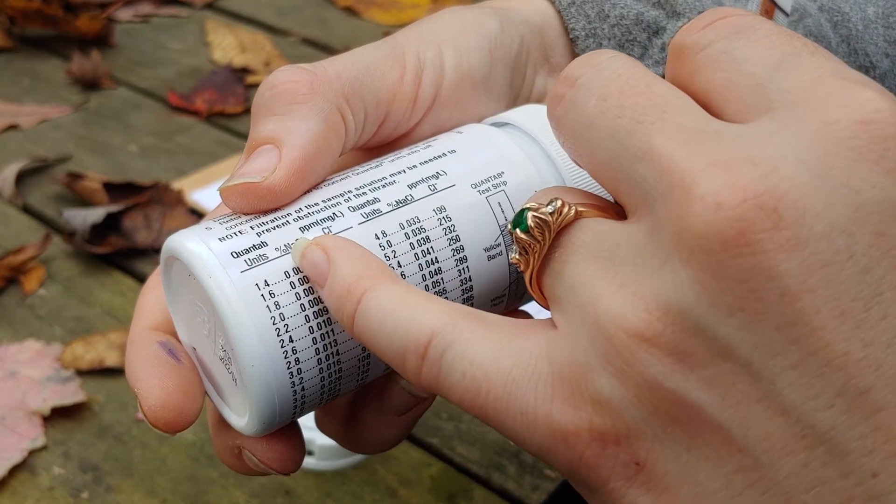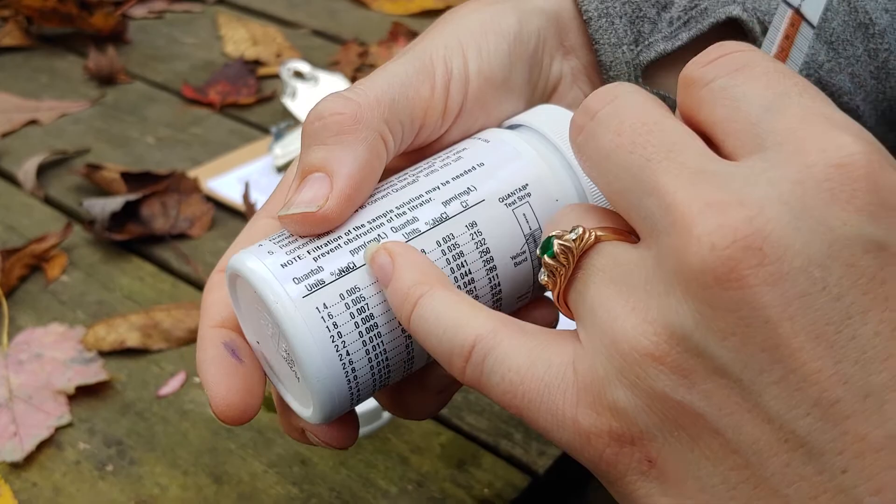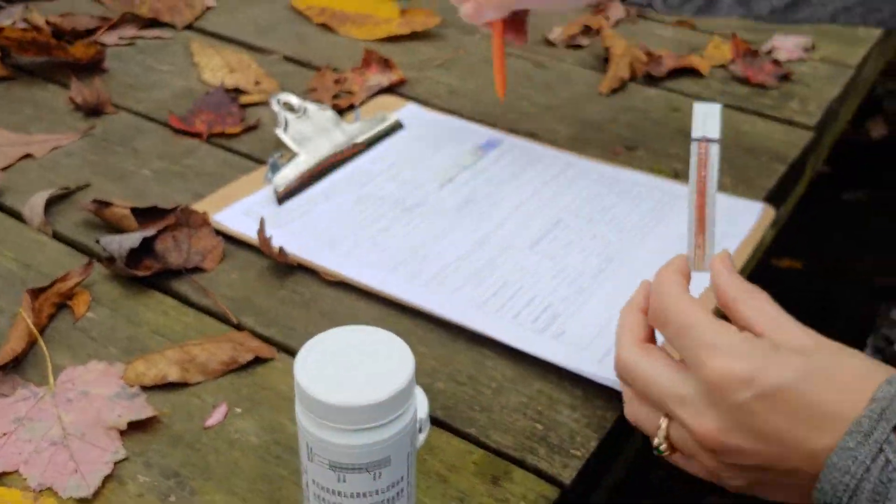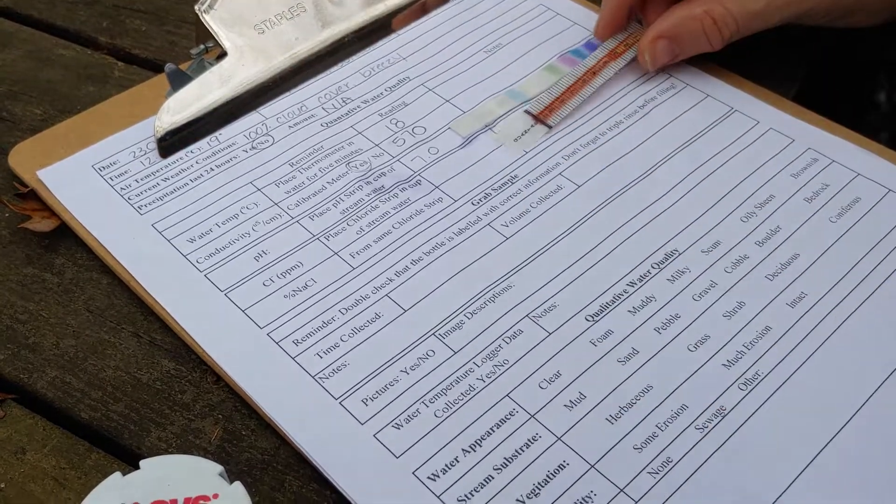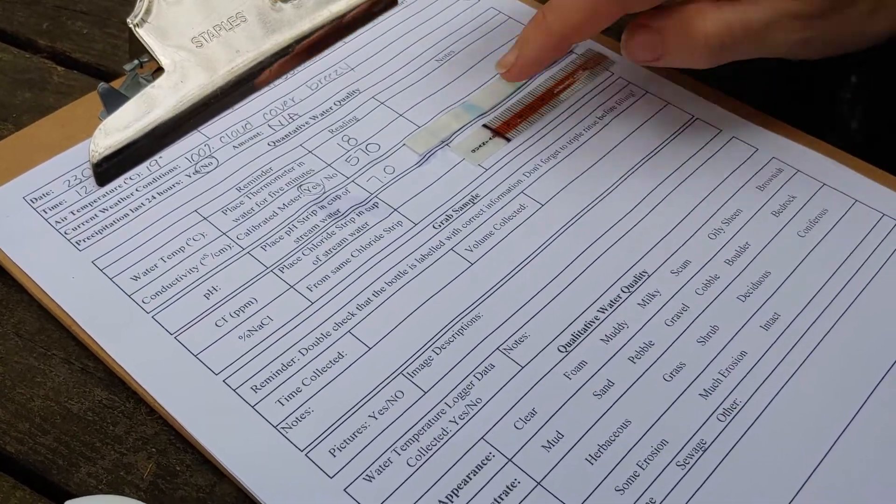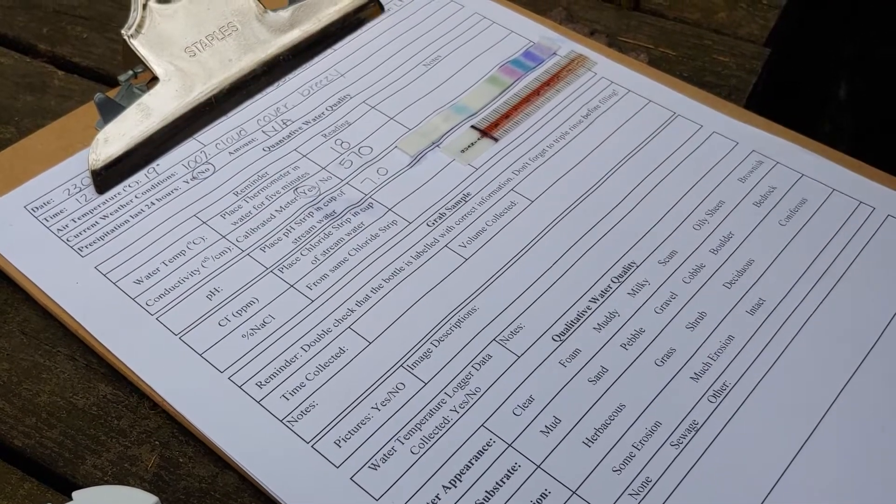So we're going to write down those two numbers - the percent NaCl and the parts per million chloride ions - onto our data sheet, and then we're going to tape our strip to our sheet so we can refer back to it when we need to.